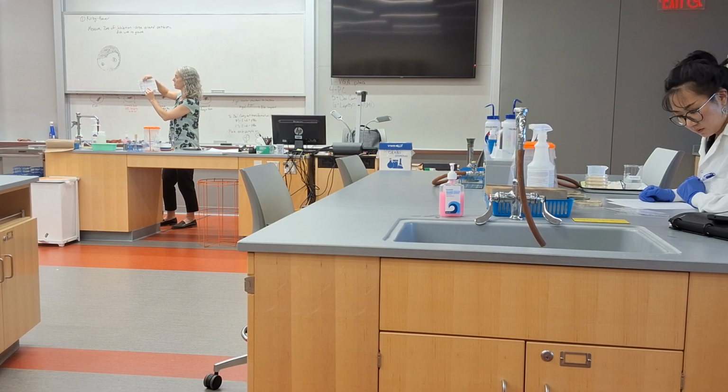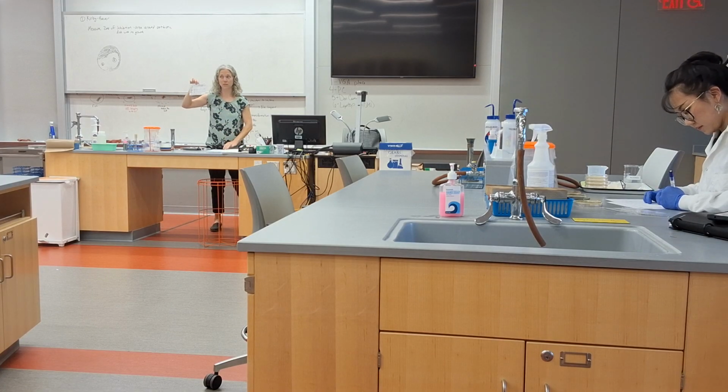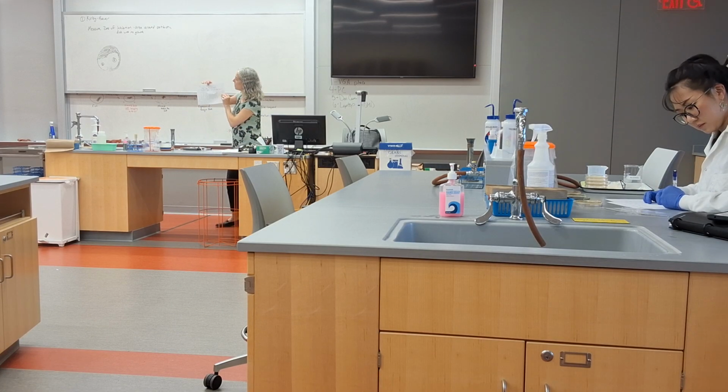If your zone of inhibition was 14, that means it's resistant. Even though there's a zone of inhibition, we have to look at this card to see whether that species is resistant or susceptible. That make sense? So that's what's going in the column next to zone size.